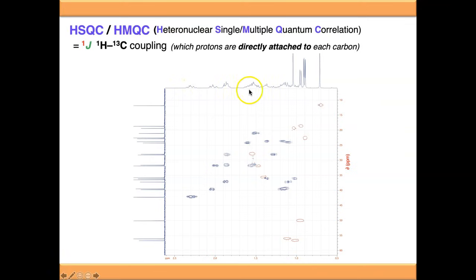So this horrendous forest of peaks that we have up here is now split out in 2 dimensions, and we can see, for instance, that this kind of group over here, which just looked uninterpretable, it was just a mass of overlaid signals. We can see that it's 1, 2, 3, 4, 5 different signals just happen to be overlaid with each other. So we can use 2D techniques to kind of help us out whenever our spectra are overlaid, we've got signal overlap or anything like that.